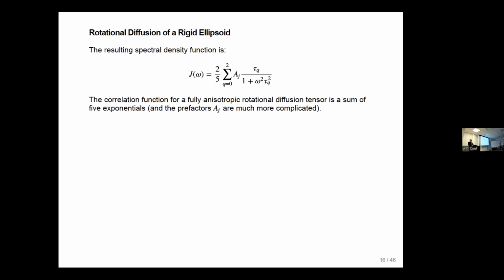Is this why zero field NMR... they get the CSA? Well, the CSA effects are gone. But then all of the J couplings are now strongly coupled.